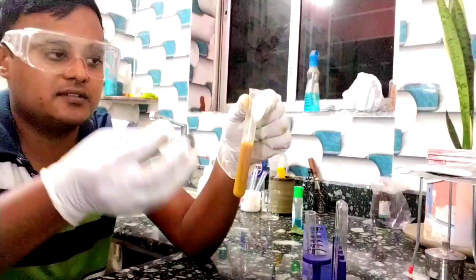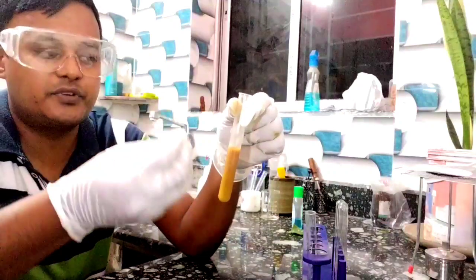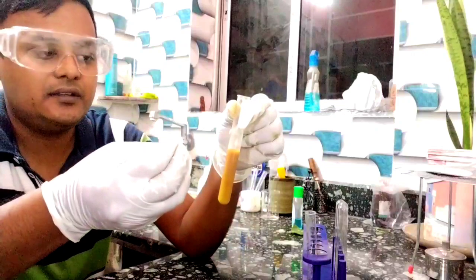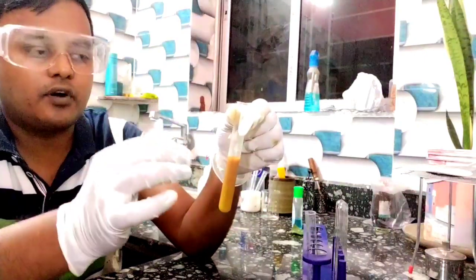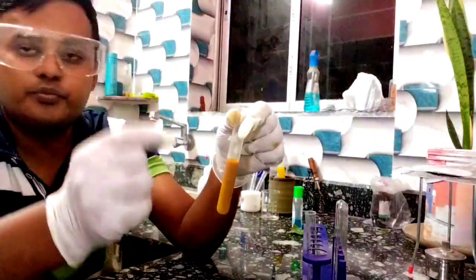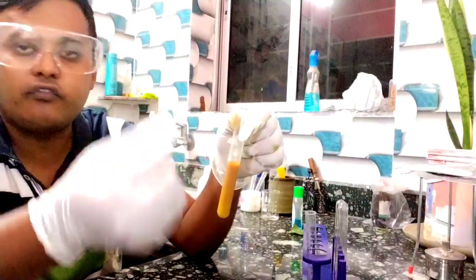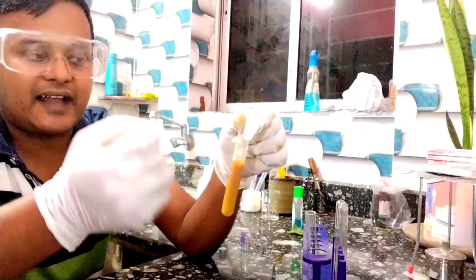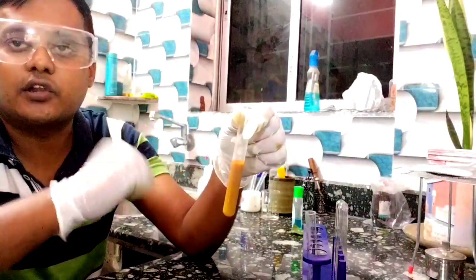After some time, just wait for about 5 minutes. See, all that cuprous iodide, it is off-white in color, it will settle down. And what are the products? CuSO4 plus KI forms K2SO4, which is a soluble solid, and cuprous iodide, Cu2I2. Now Cu2I2 is an off-white solid, it will settle down. And iodine is evolved. Iodine is one of the products, it will be in the solution.